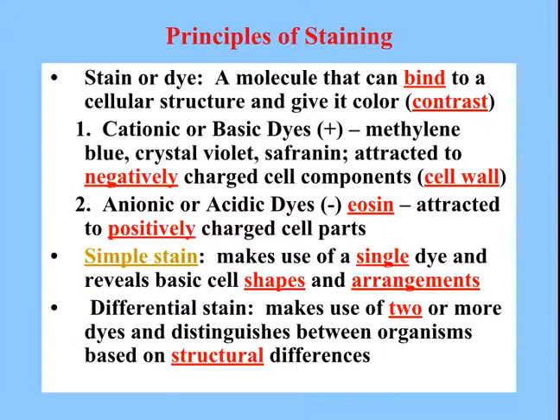Some of them you used yesterday or the other day in your simple staining because they are attracted to the negatively charged components of the cell, which is the cell wall, which helped us give the idea of what shape and arrangement the bacteria happen to be. There's also acidic or anionic dyes that are attracted to the positively charged parts.